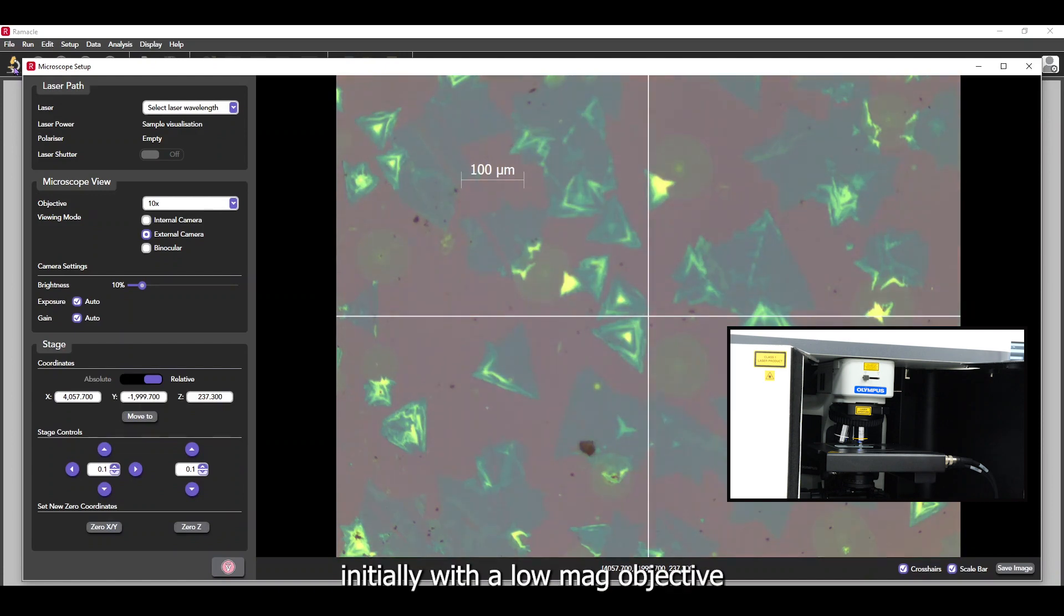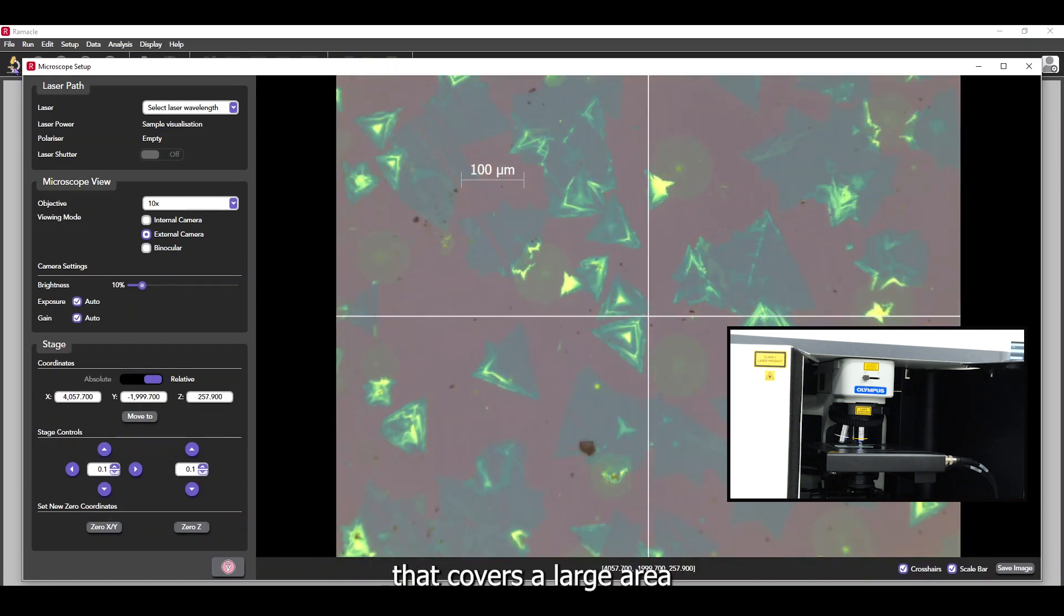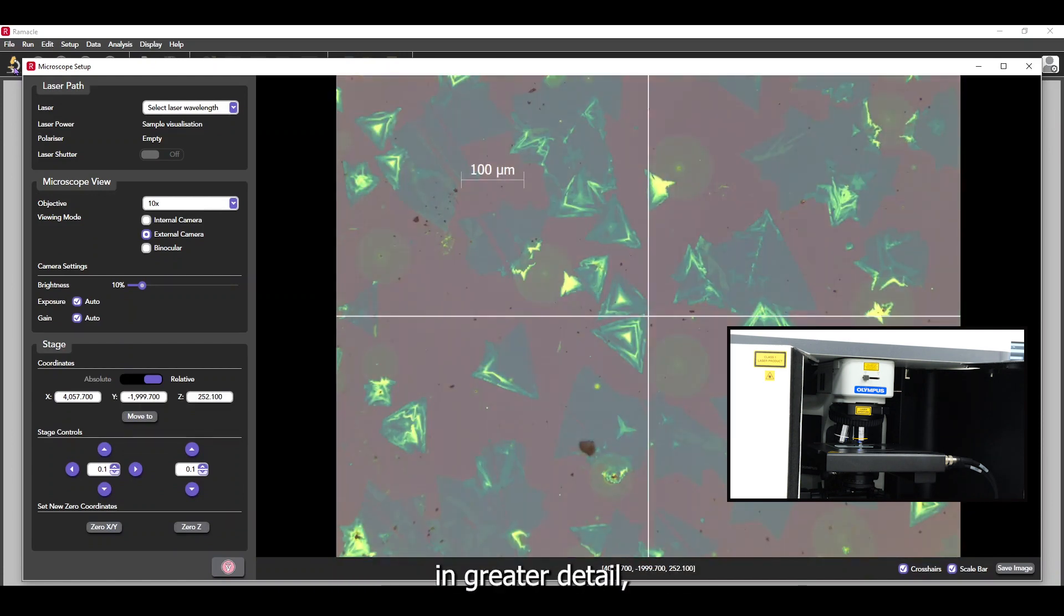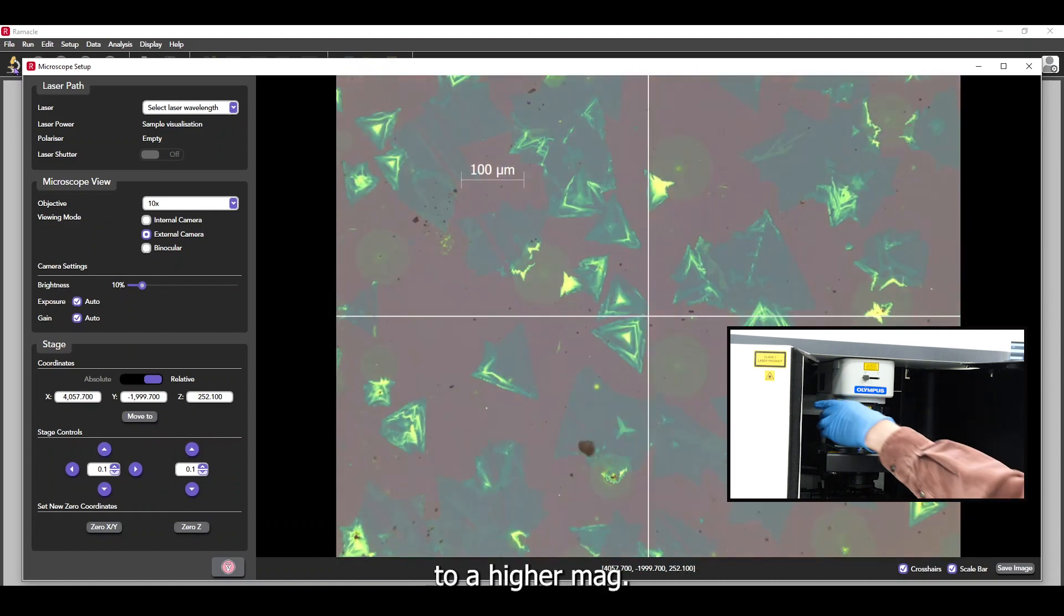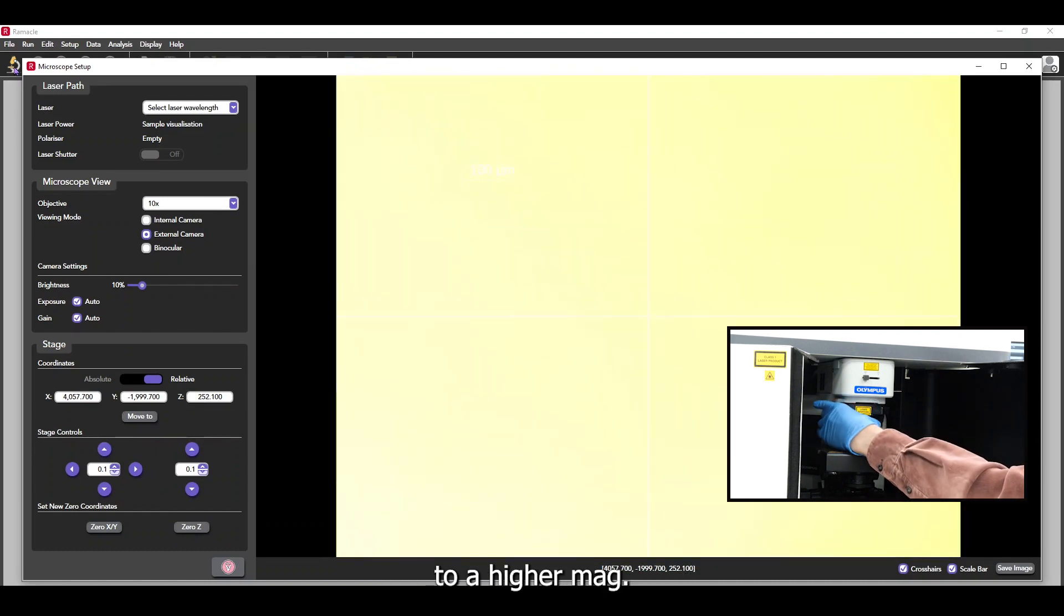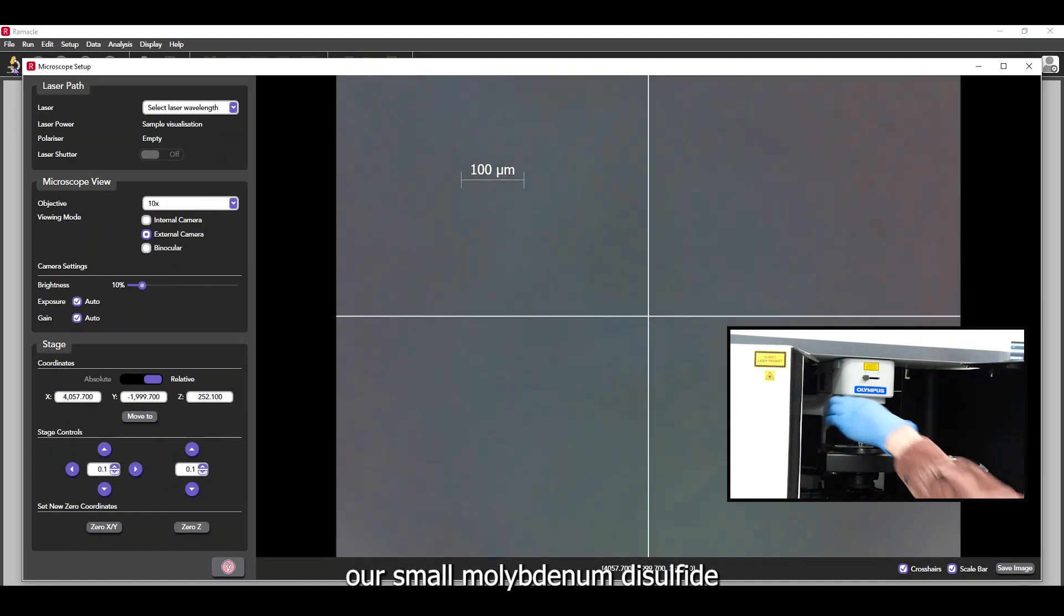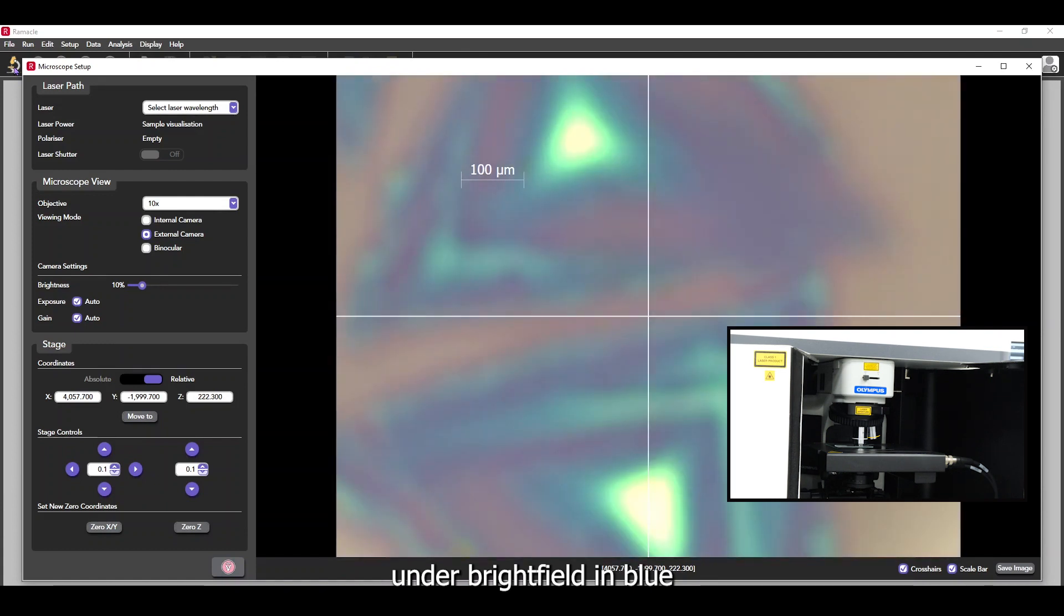We do this initially with a low mag objective that covers a large area and to view the sample in greater detail, we can change the objective to a higher mag. Here, our small molybdenum disulfide crystals can be seen under brightfield in blue, with the underlying silicon wafer in grey.